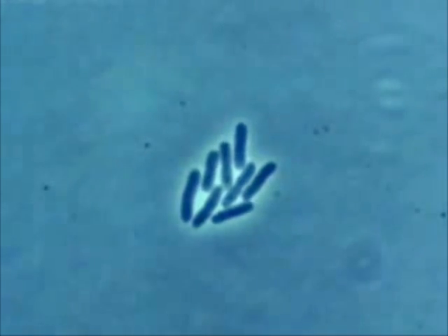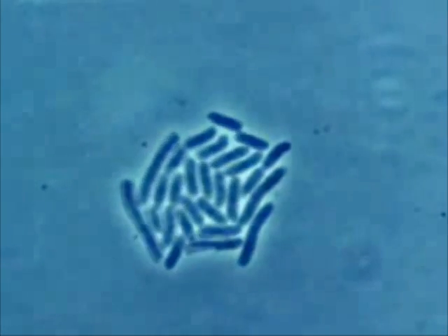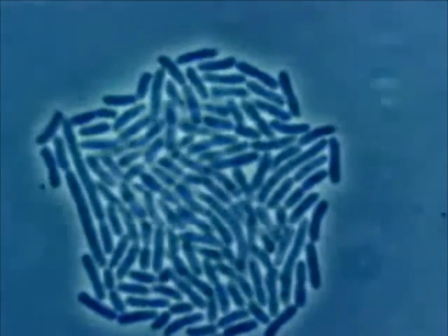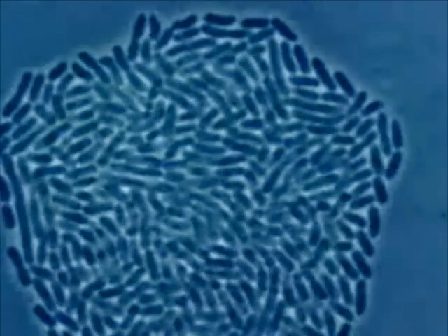A microbial world. Today we'll be talking about the Winogradsky Project. In ecology, succession is the progressive change in the plants and animals of a region. In order for these organisms to advance, microbes or elements continuously create or aid the growth of other organisms, completing the circle of life. Within ecological succession, there is microbial succession, which is the selection and development of sequential microbial populations in natural or disturbed systems.